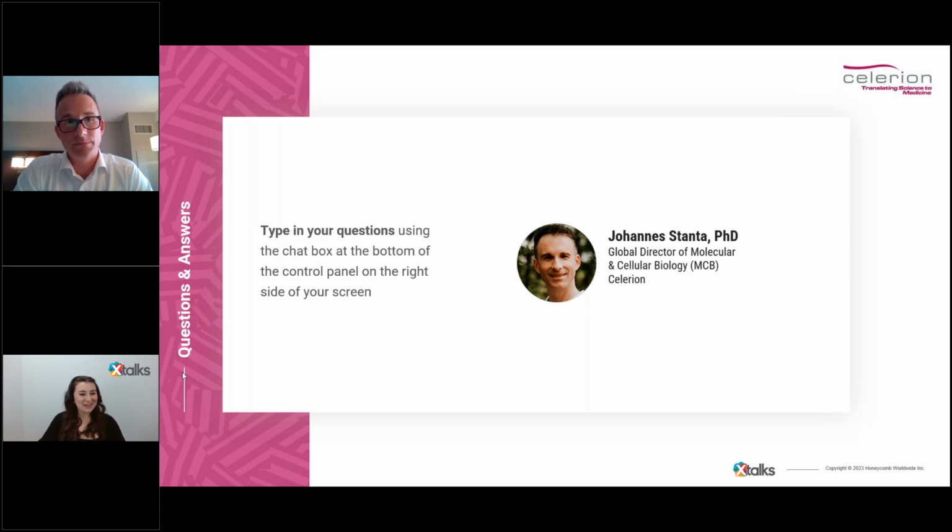All right, thank you very much for that answer. Another audience member would like to know, in LBA and LC-MS or MS assays, LOD is not utilized. What value does it provide when the LLOQ is what is important for reporting the number of copies or concentration?